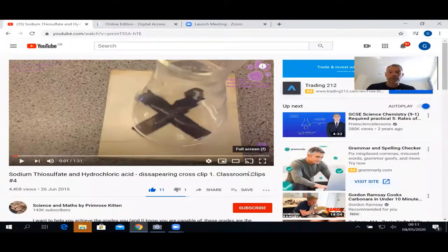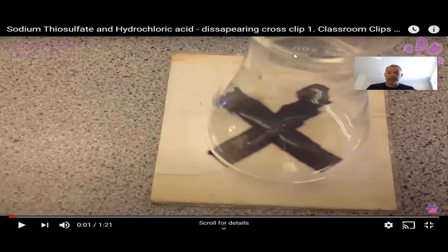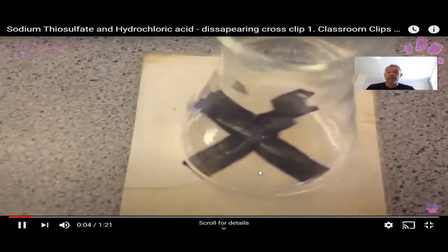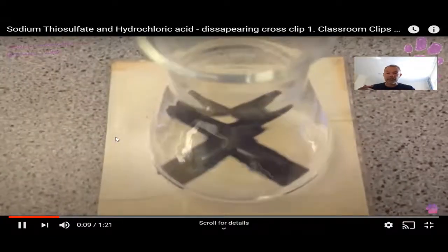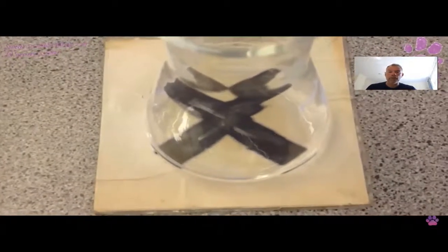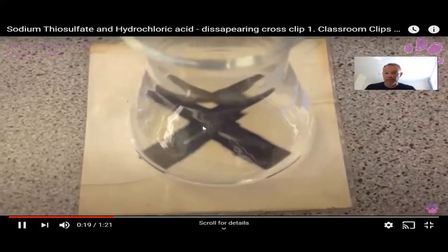So if I put this on full screen, what we have here is our conical flask, and we're going to mix together the two reactants, hydrochloric acid and sodium thiosulphate. We've put a cross underneath, and we can currently see that cross because it's clear, it's see-through. So I guess it's the hydrochloric acid he's adding, and the reaction has now started. Now, he would have started, or she would have started the stop clock, so we're timing it, and we're going to time how long it takes for that to get so cloudy that you can't see the cross anymore.